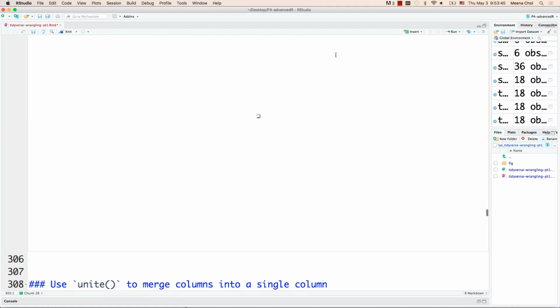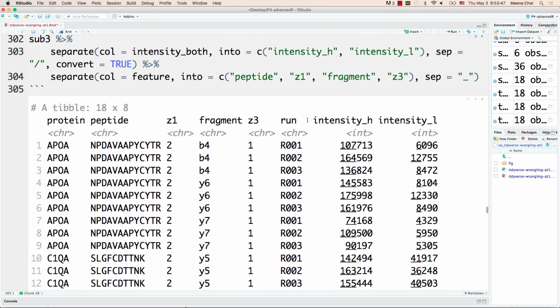So in some situations, it may be very meaningful for some people if they want to look at specifically what precursor ion or fragment they want when they design or try to analyze their data.